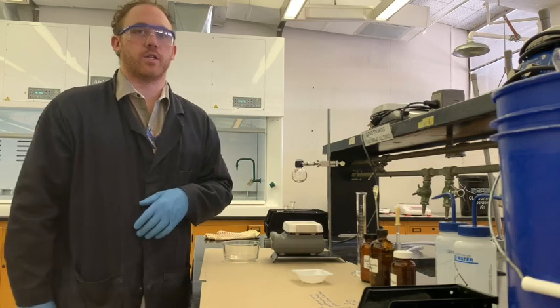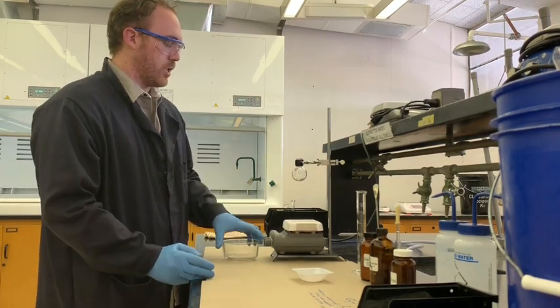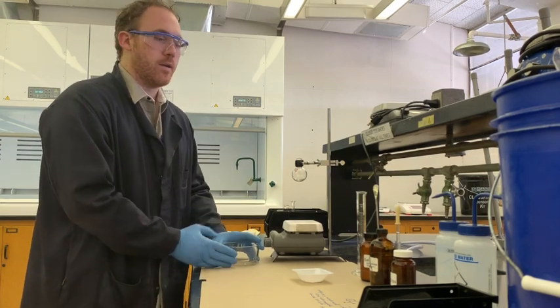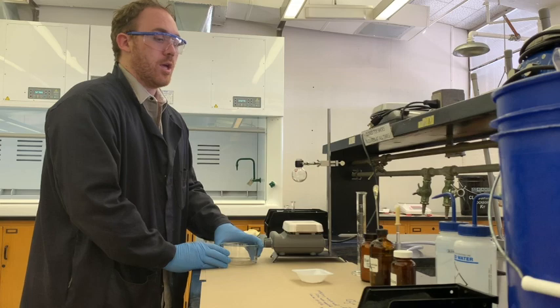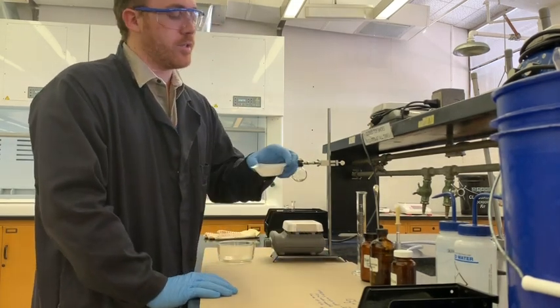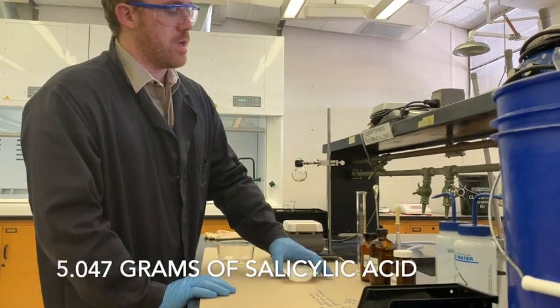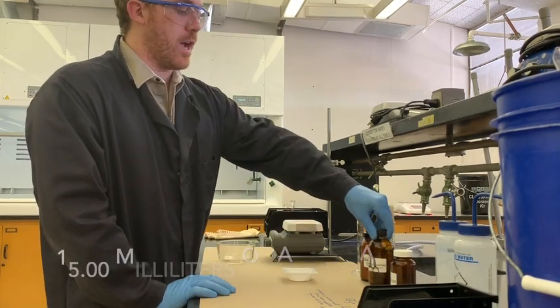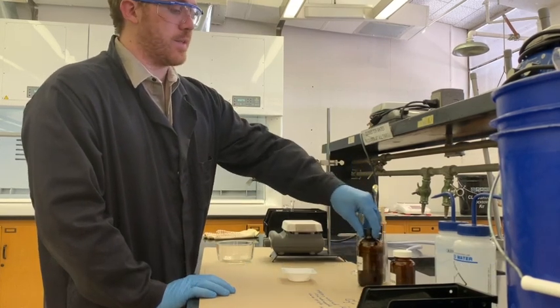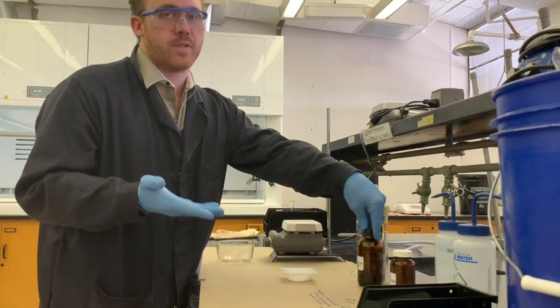Today we're going to be doing an acetylation of salicylic acid. For this acetylation we're running it at relatively low temperatures using a water bath - we're not going to be working in the hood. We're working with salicylic acid, already weighed out at 5.047 grams, and acetic anhydride in liquid form to dissolve and react with it. That's what we call a neat reaction where we don't have any solvent.